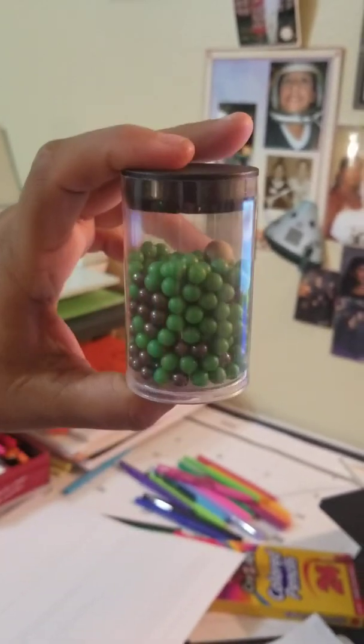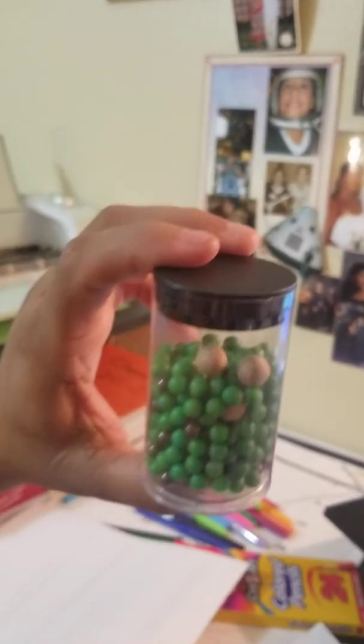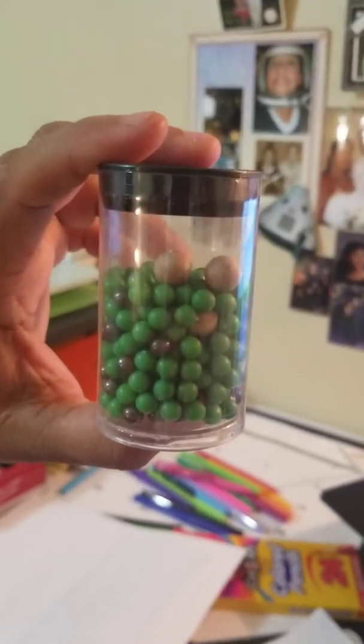You know, in science class, it doesn't always work out how you want it to. So I'm just doing a little bit more than 4 shakes because this is what I want. Now, this is what we're going to consider to be our last one. Okay?